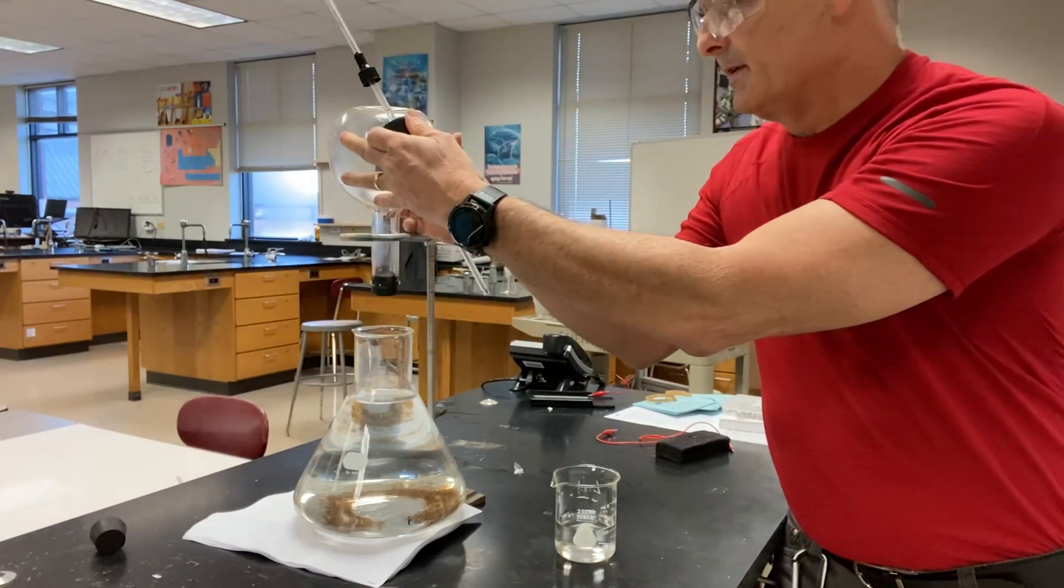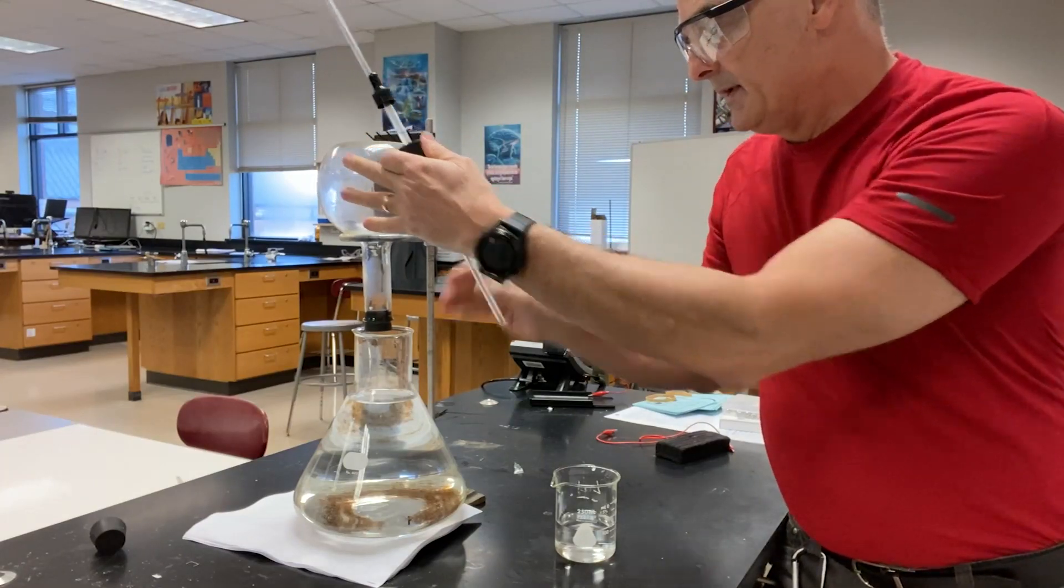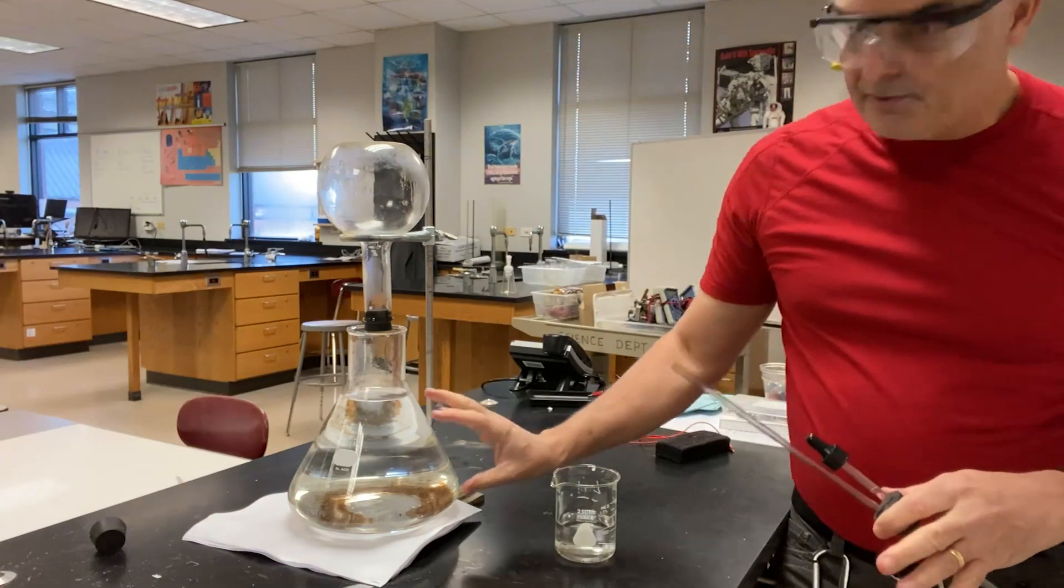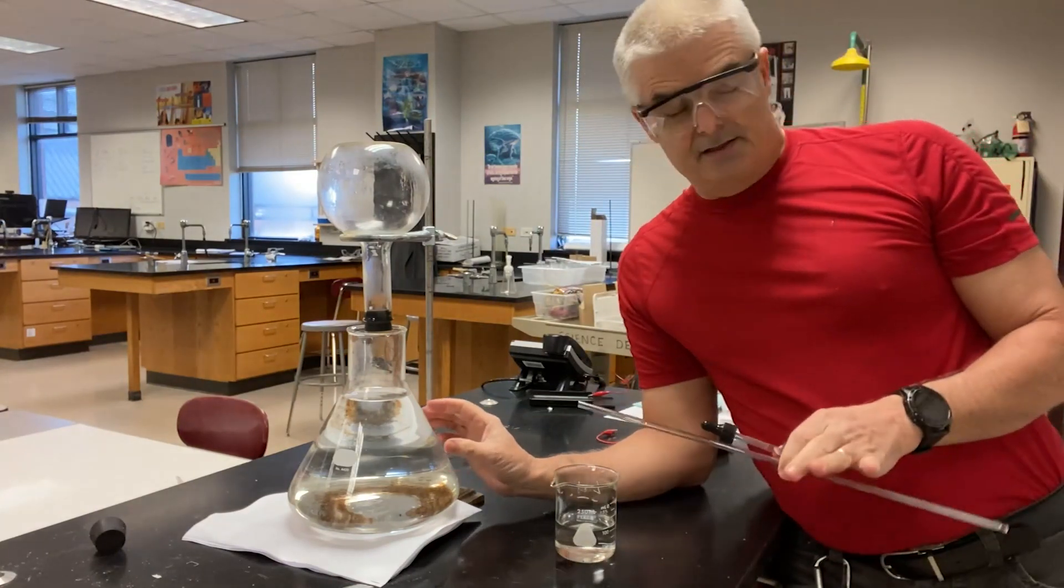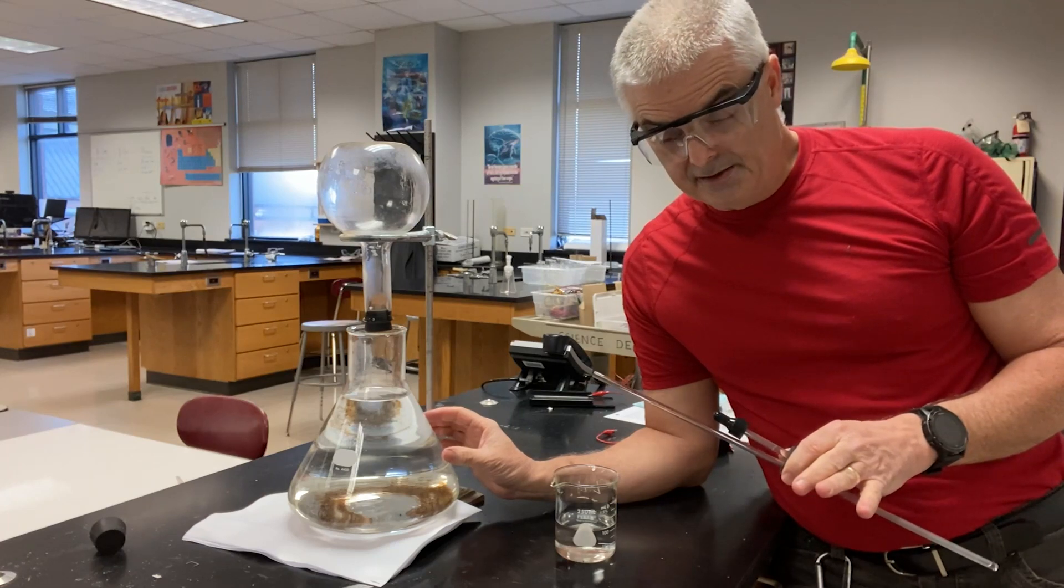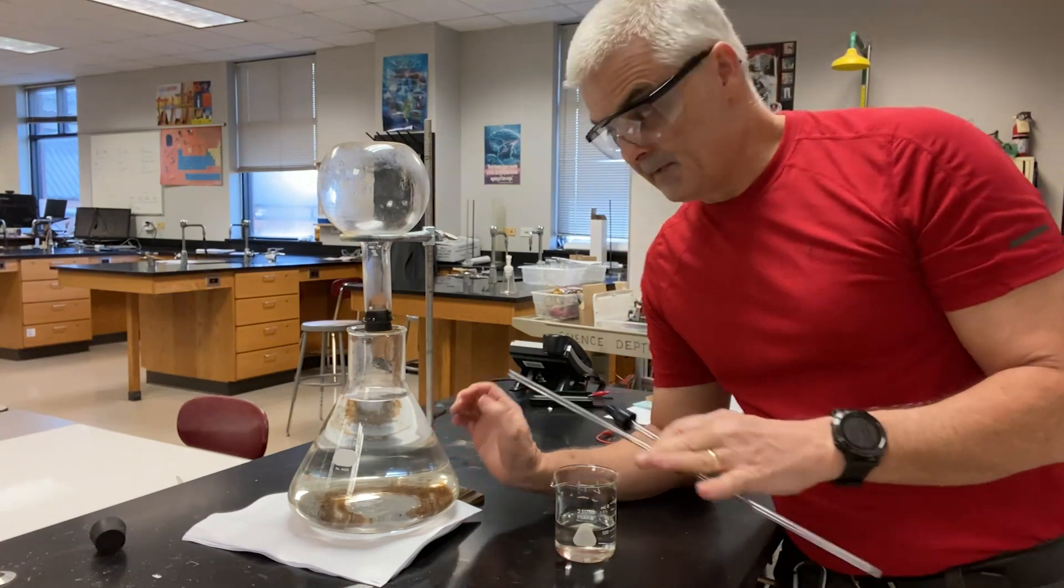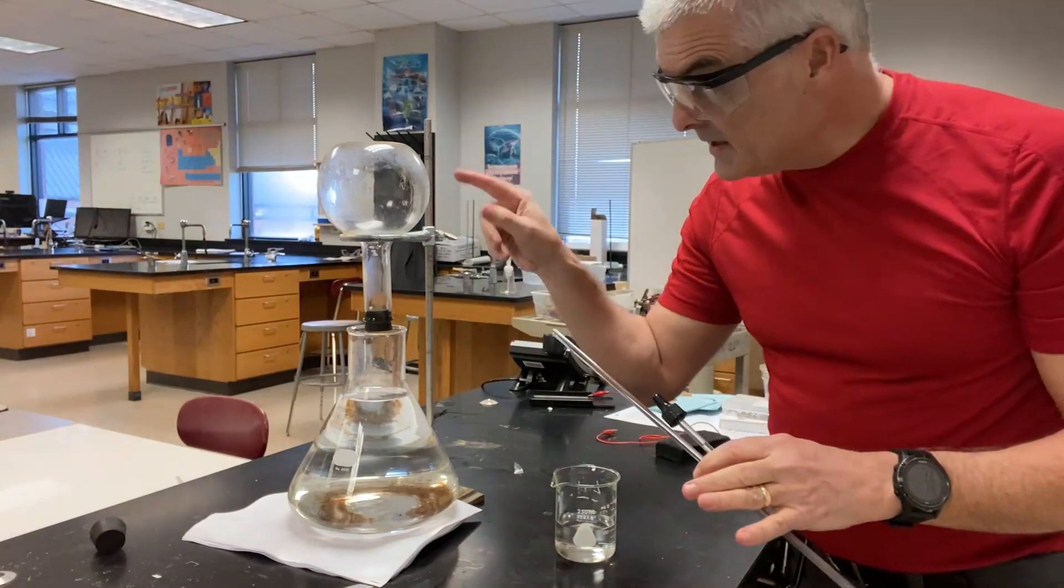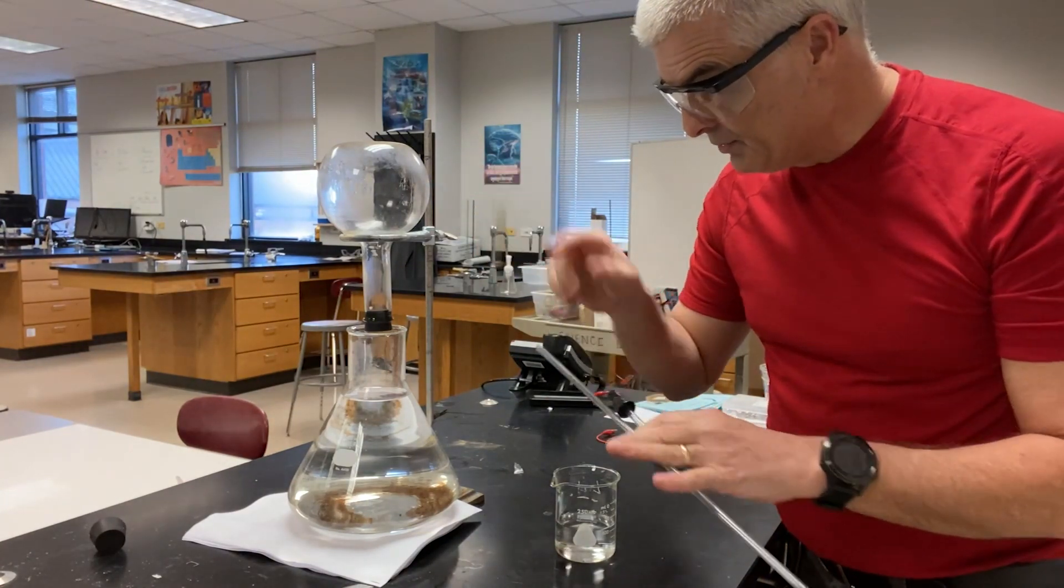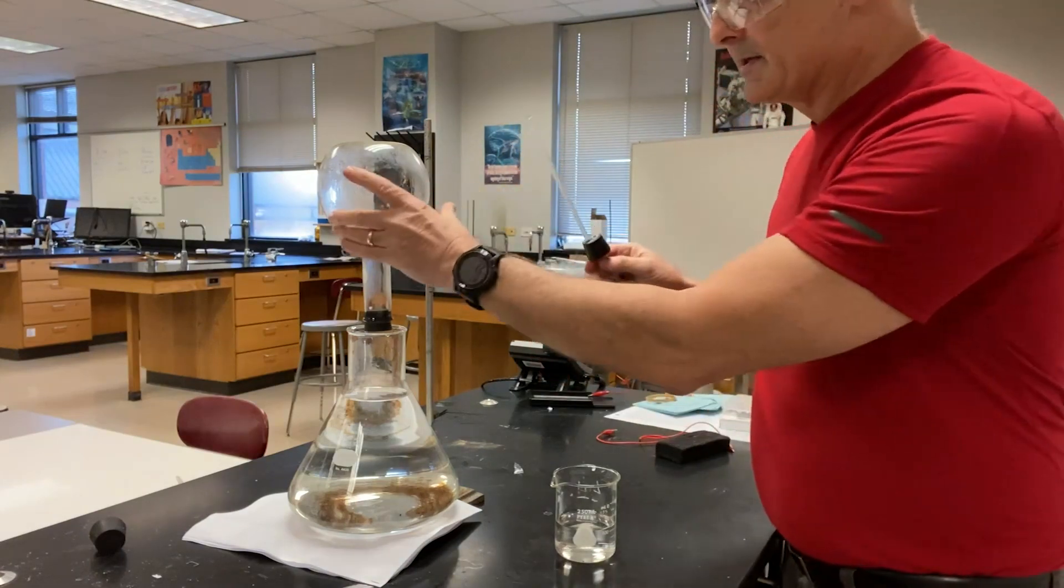And then what I'm gonna do is I'm gonna take this flask right here. I'm gonna put it inside the ring stand. Now this large flask is filled with water, and I've put a few drops of phenolphthalein in there. We'll explain the chemistry of it afterwards. So remember, what's in this flask is ammonia gas, almost completely ammonia gas.